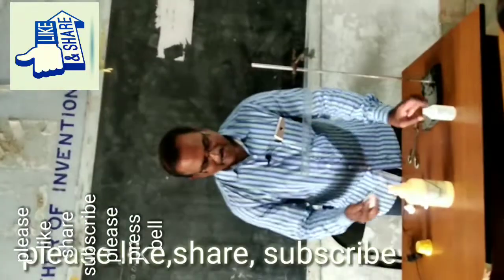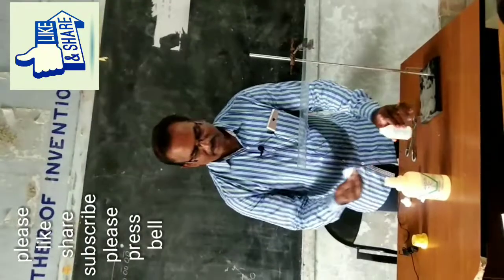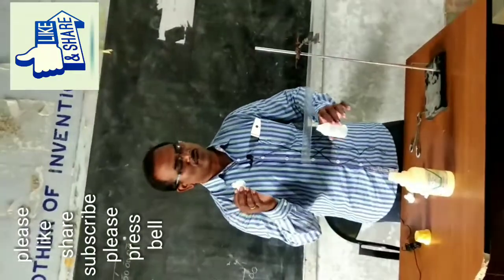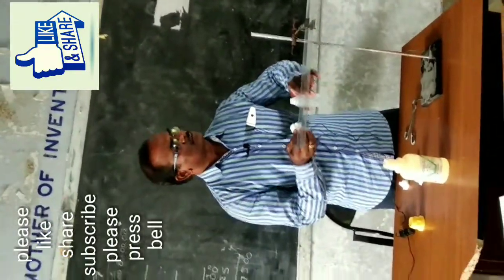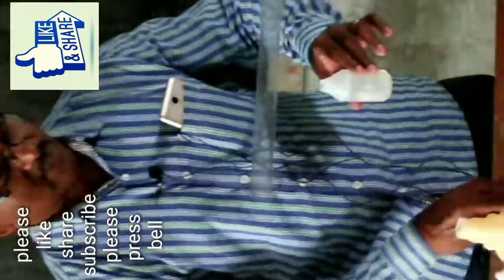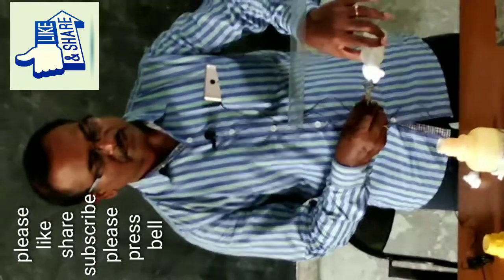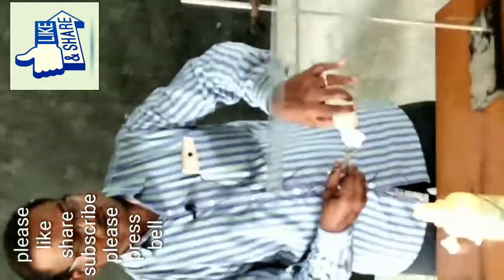Take a piece of cotton ball and make it wet using hydrochloric acid with the help of thomps. Because hydrochloric acid is a dangerous solution, don't touch it with your bare hands — make it wet with the help of thomps.